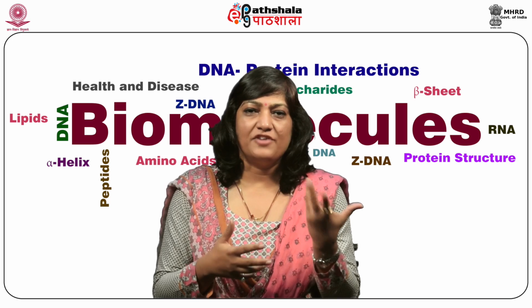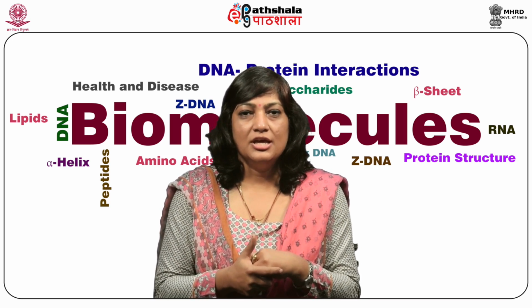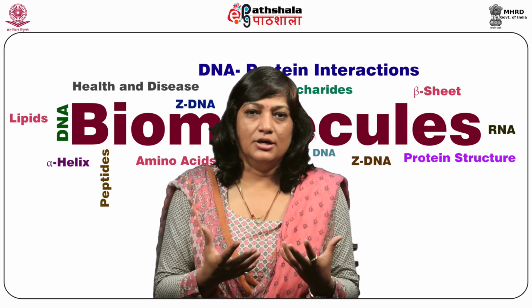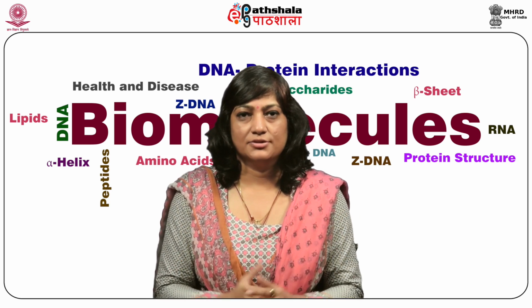There are also specific hydrolysis methods that can be used to analyze fatty acid composition, and we will go through all these methods in detail as we move on in this lecture.